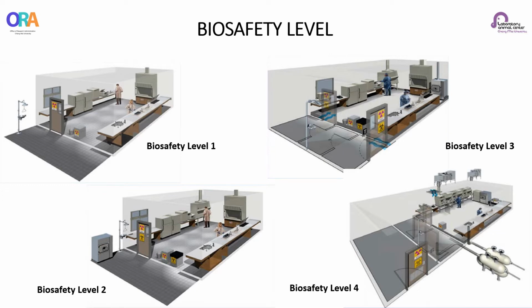Agents with a close or identical antigenic relationship to agents requiring BSL-4 containment must be handled at this level until sufficient data are obtained either to confirm continued work at this level or to redesignate the level.